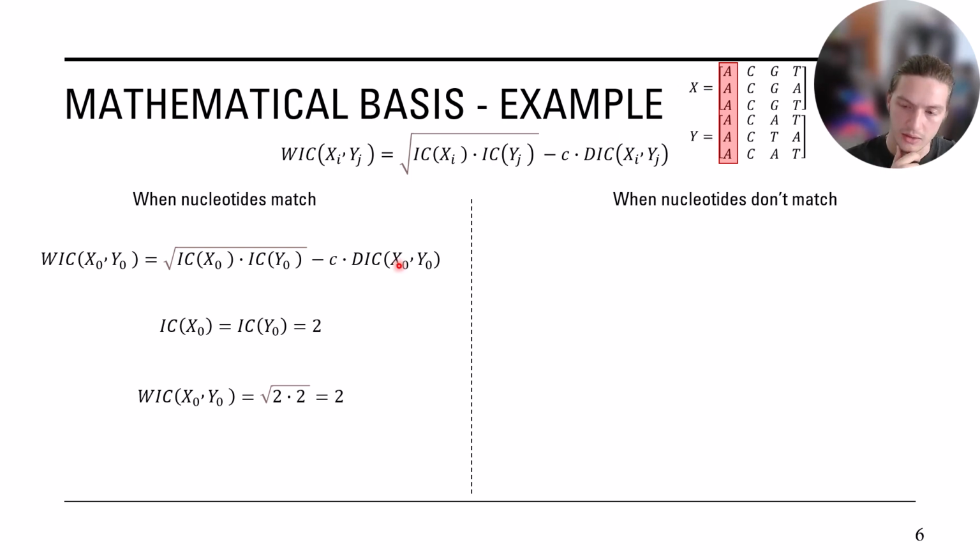Something to note is that in order to look at a comparison between 2 motifs, you need to align them first. Otherwise, this isn't going to be as meaningful if you're just comparing positions.